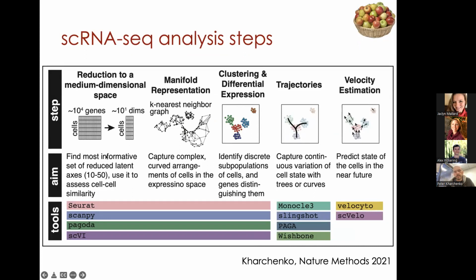There are many ways of doing this, and it's a major area. You can use very simple techniques such as principal component analysis, standard things. You can use very fancy things like deep neural net autoencoders that will effectively try to find an optimal nonlinear embedding or reduction of these individual gene values into some sort of latent dimensions, say a dozen latent dimensions. Even in these latent dimensions, the structure of the populations is often very nonlinear. And so to capture it, people use graphs.